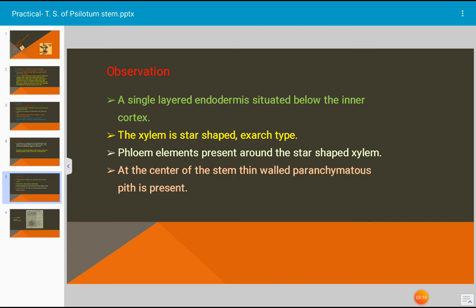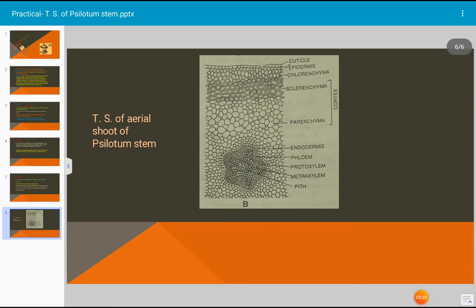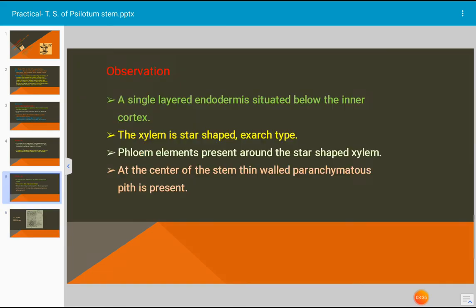The xylem is star shaped, exarch type. Why is it exarch type? The protoxylem is placed at the peripheral region and metaxylem is placed at the central region of this star shaped xylem. Such situation is described as exarch type. The phloem elements present around the star shaped xylem.